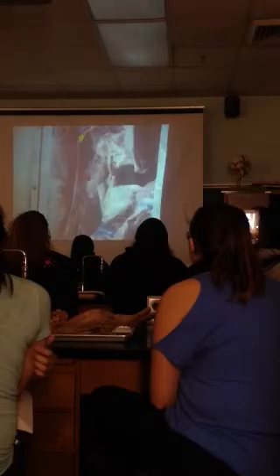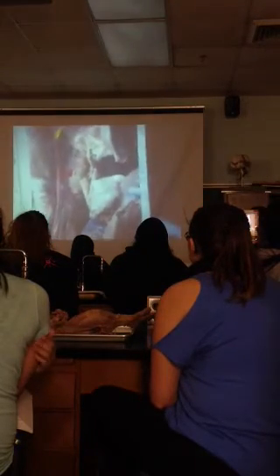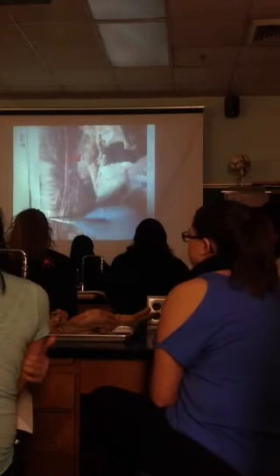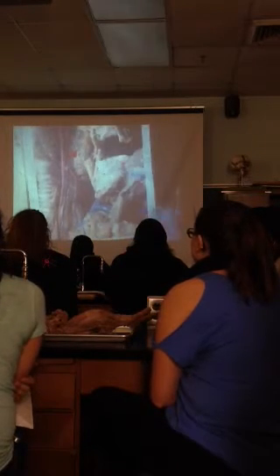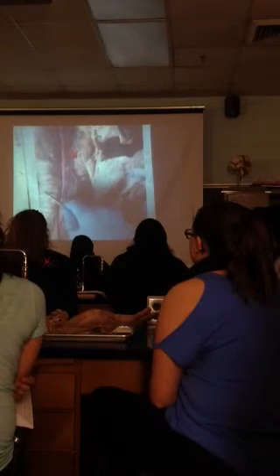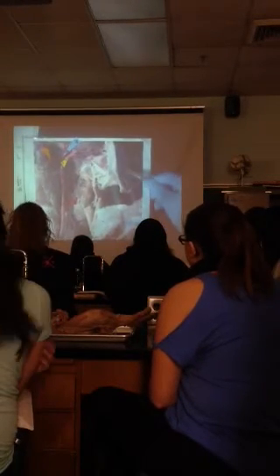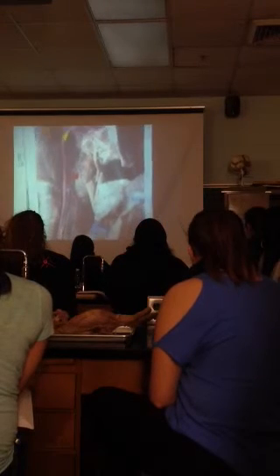This is a picture of just the neck specifically. So right here would be the windpipe, also called trachea. This is the medial side. You see those C rings of hyaline cartilage like we learned in 250? Okay, and the neck's been peeled back. You can see just the ears right up here.